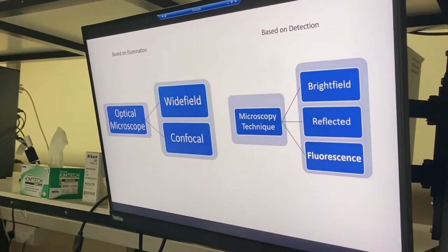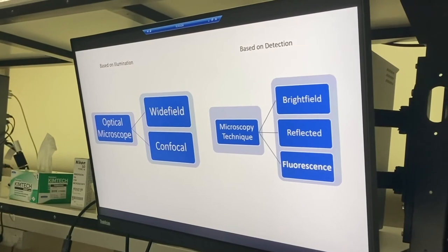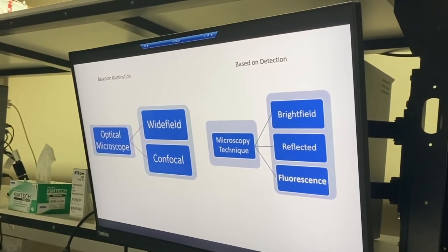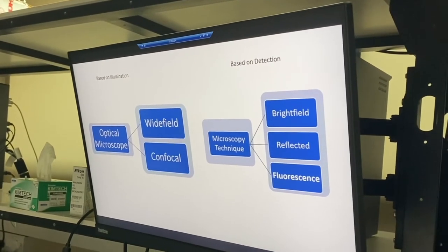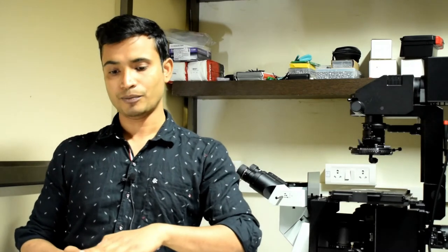The microscope in the cell culture room looked a bit different. There are several types of microscope based on the illumination path or detection path. Based on detection path, microscopes can be divided into bright field, reflection mode, and fluorescent microscopes. In bright field microscopy, transmitted light from the sample is detected by the detector.